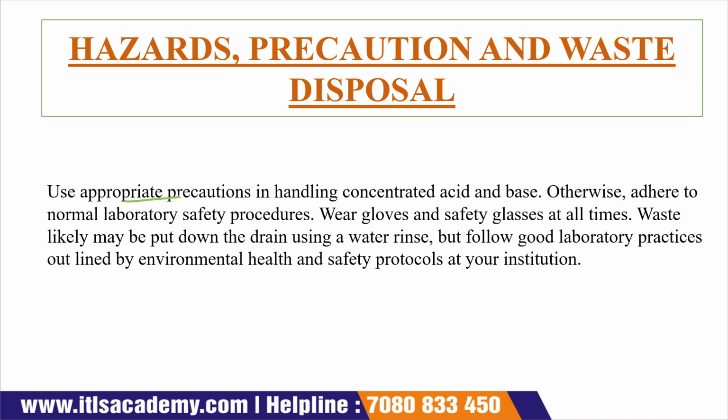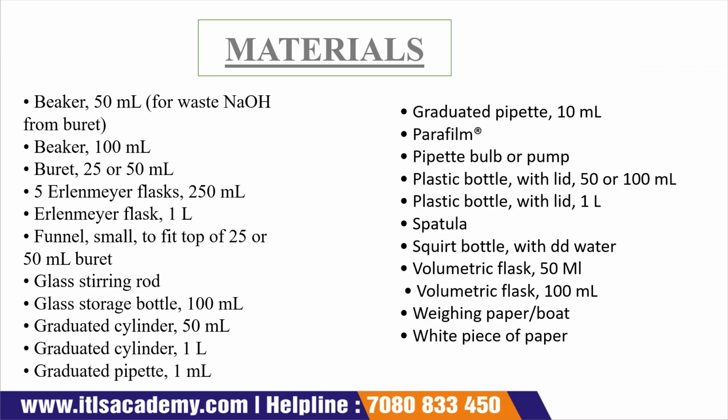Use appropriate precautions in handling concentrated acid and base, in addition to normal laboratory safety procedures. Wear gloves and safety glasses at all times. Waste likely may be put down the drain using a water rinse, but follow good laboratory practices outlined by our environmental health and safety protocol at your institution. Okay, now the next one is the material required for this experiment.